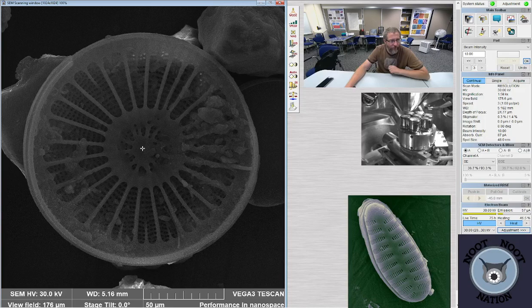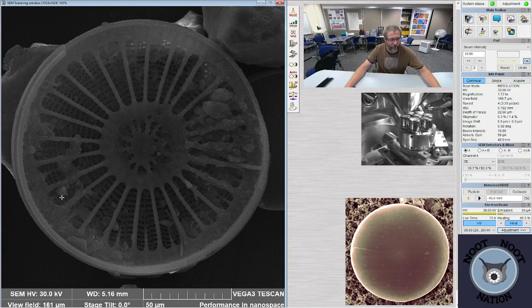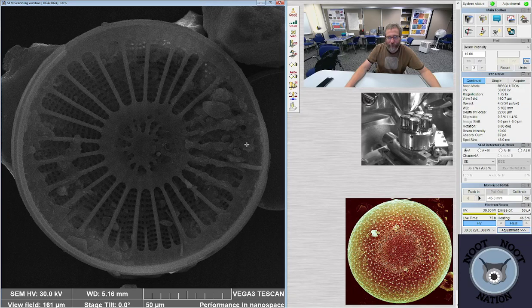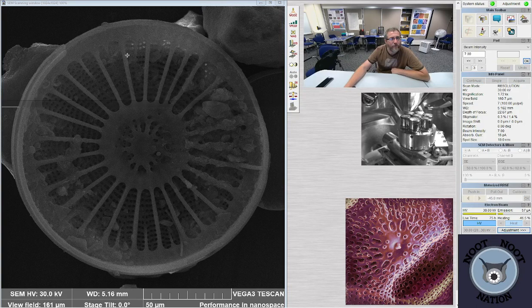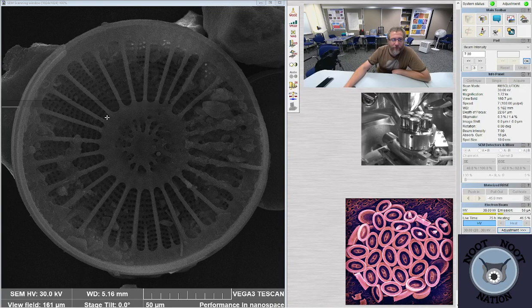And just for scale, the diatoms that we were looking at last time on the Jackson Lake, like earlier on the other stub, they were usually ranging from somewhere around 5 to 30, maybe 40 microns. So this one's 160 across. So marine stuff is really big compared to freshwater stuff pretty commonly. And all the stuff that's trapped in here is probably clay or organic matter that didn't degrade when we processed it. More likely, it's probably detrital clay.